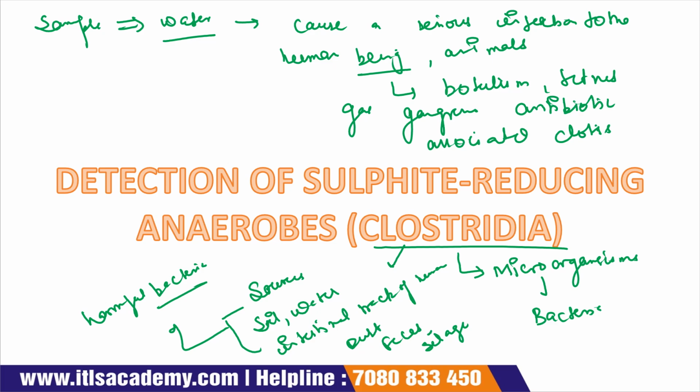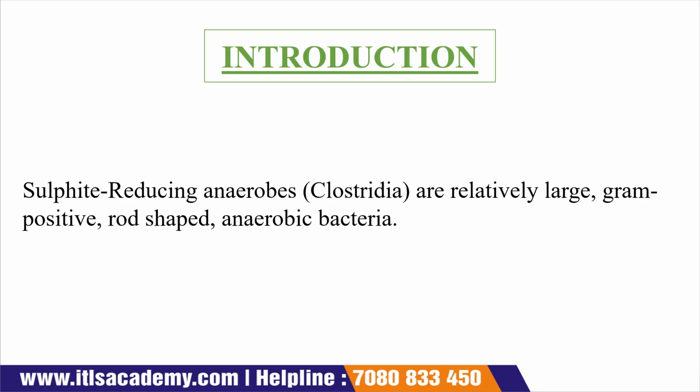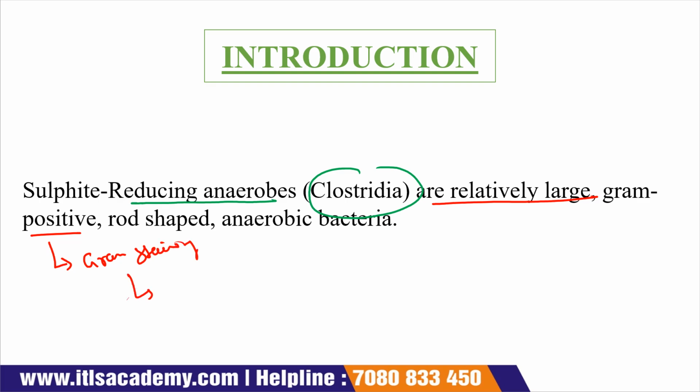Now start our lecture. Introduction. We all know that the sulfite reducing anaerobe, that is Clostridia, they are relatively large gram positive. Gram positive means that when we perform a gram staining, then it gives a purple color colony during the microscopic visualization.